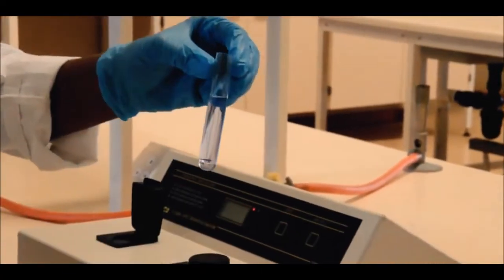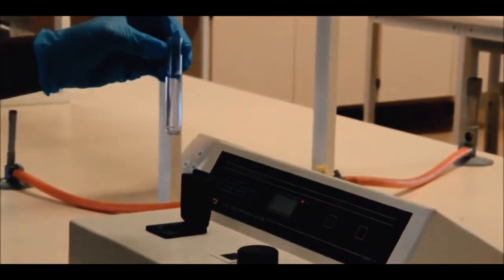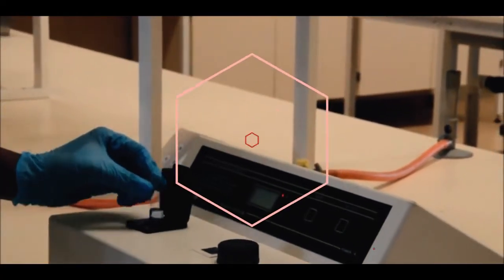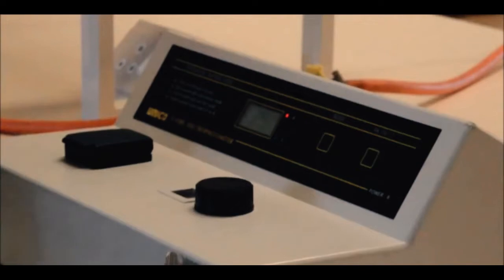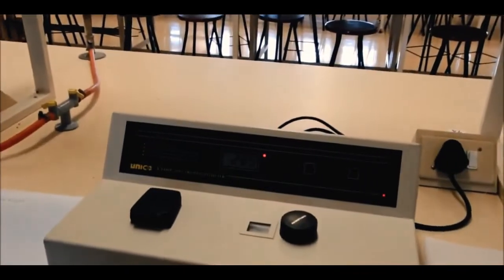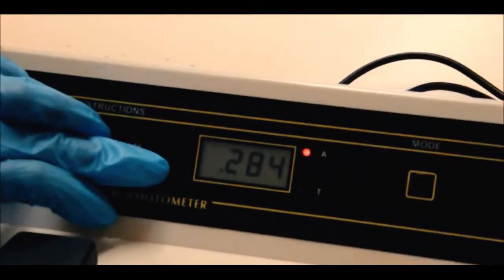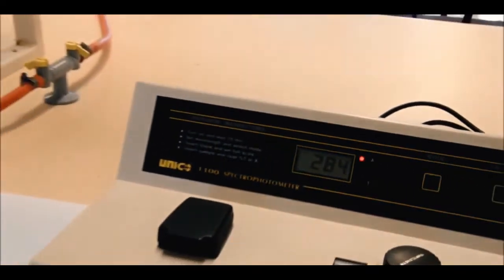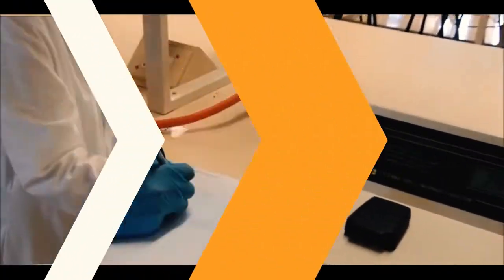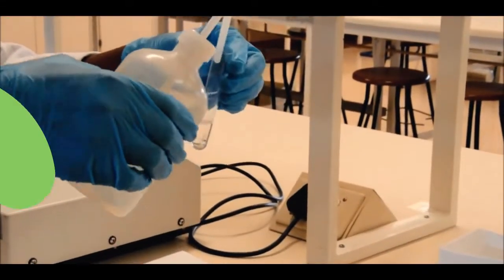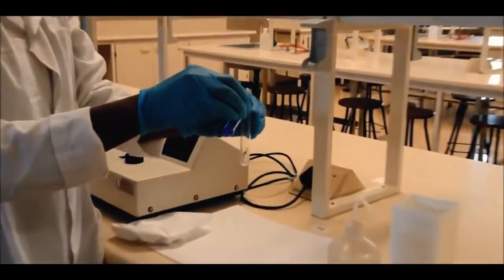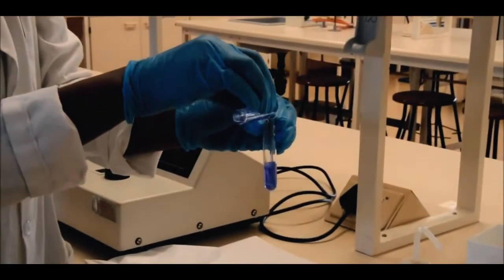The absorbency reading is allowed to stabilize and is recorded in a lab book. This cuvette is then removed and emptied, where after the cuvette is once again rinsed with distilled water. The content of the next tube is then carefully transferred to the cuvette.